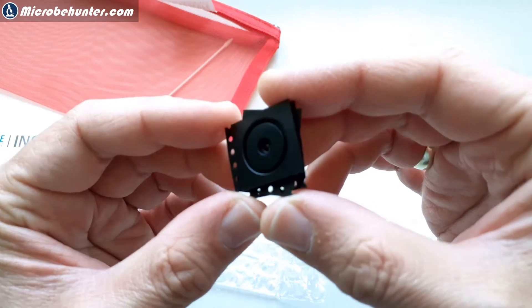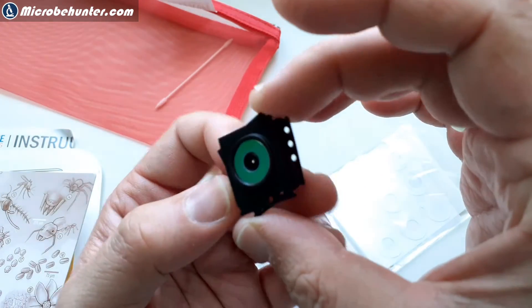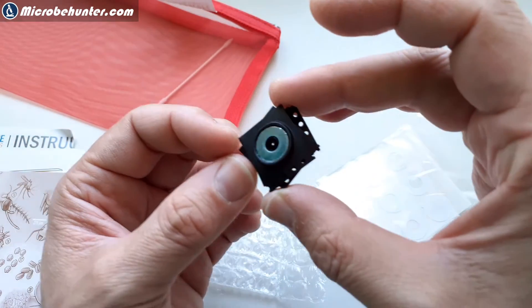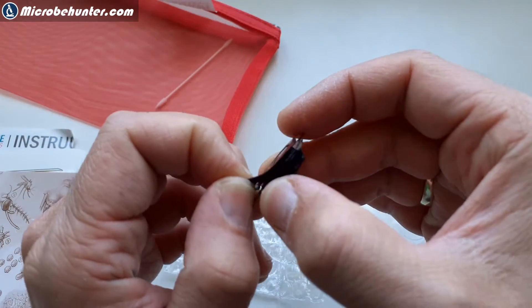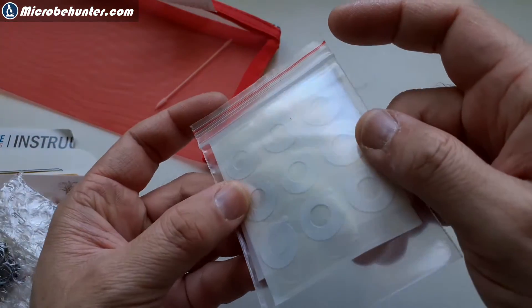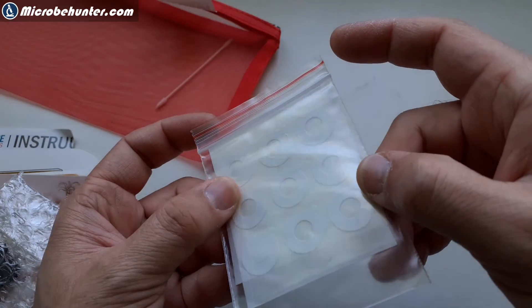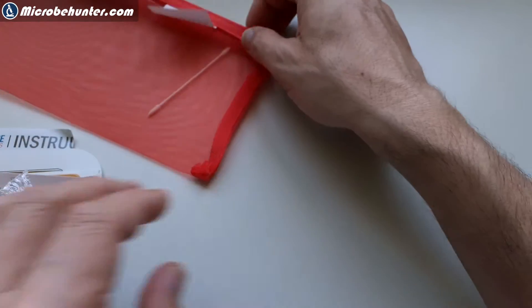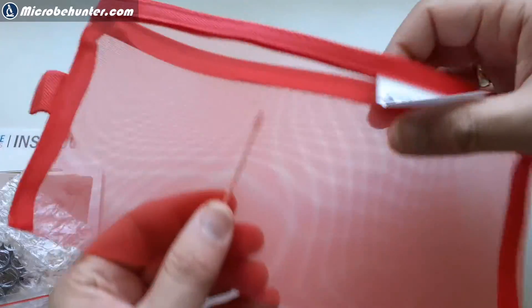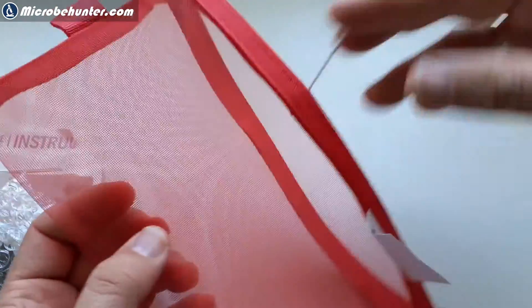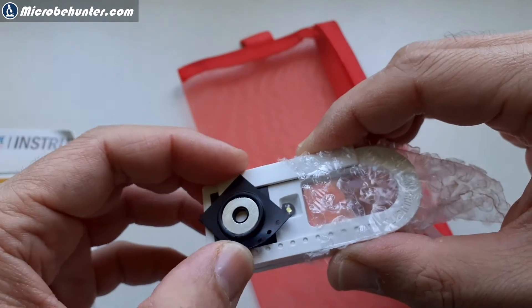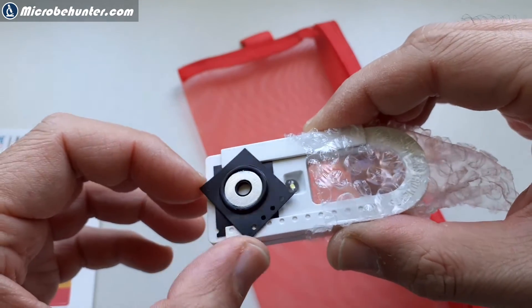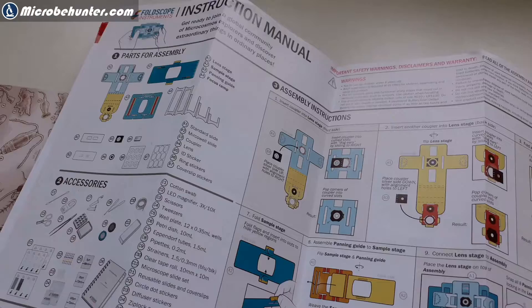I'm going to show you how they have to be attached to the Foldscope. So first I was kind of afraid to separate them. I did not know that they were magnetic. I thought they were kind of glued together, so I was afraid of breaking them. But they were actually holding together like this. A couple of stickers as well were included. And there was also a cotton swab for cleaning the lens. And you can see here that the whole thing here was magnetic indeed. So these are the couplers.